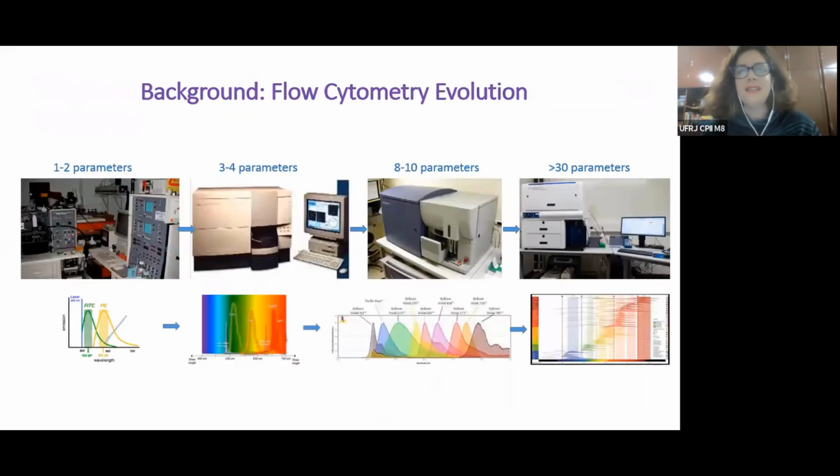But nowadays, flow cytometry has become a big data area because the number of parameters studied per cell and the number of cells studied together form a matrix by far larger than the matrix from microarrays, for instance.